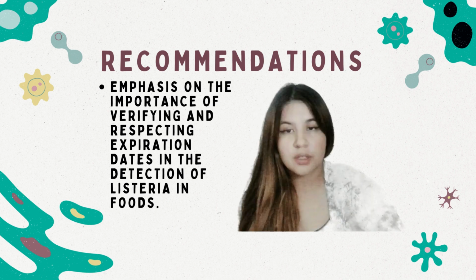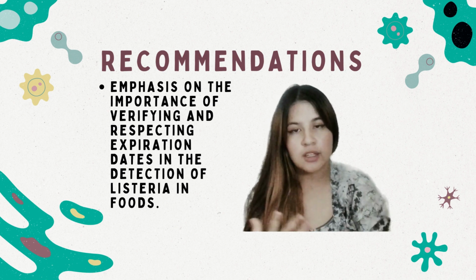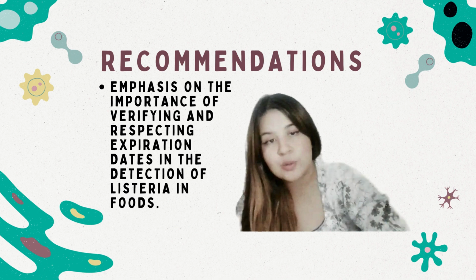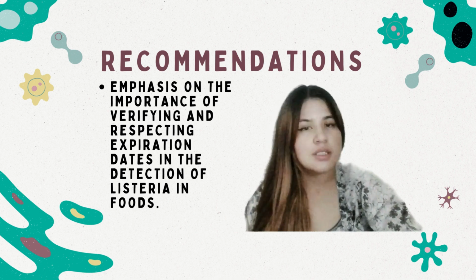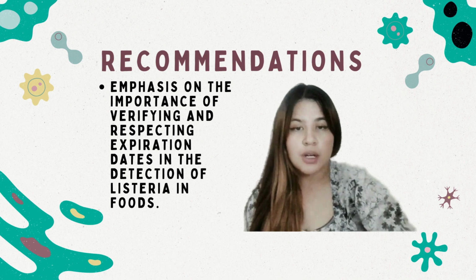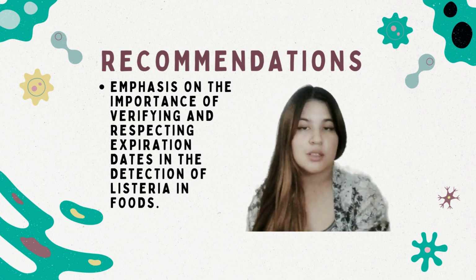In recommendations, it's essential to emphasize that in a real situation, when it's necessary to obtain reliable results on the presence of Listeria monocytogenes in a food sample, verifying and respecting the expiration dates is of the utmost importance.